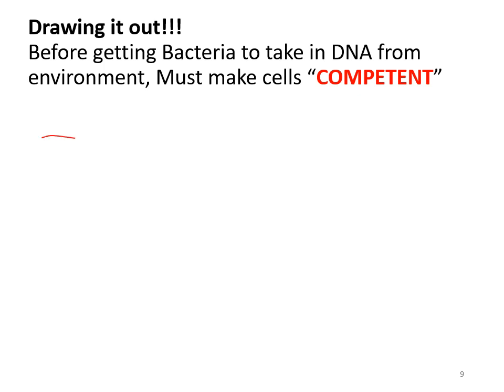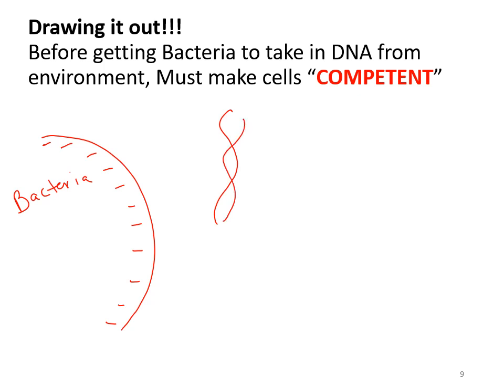When you have a bacterial cell, okay, so bacteria, you have that outer membrane of the bacteria, and that outer membrane is highly negative because there's a lot of lipopolysaccharides. Okay, so the bacterial cell is highly negative. Now you want that bacteria to take in DNA from the environment, and what do you know about DNA? What charge does DNA have?